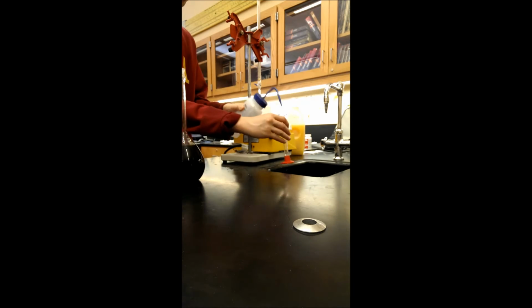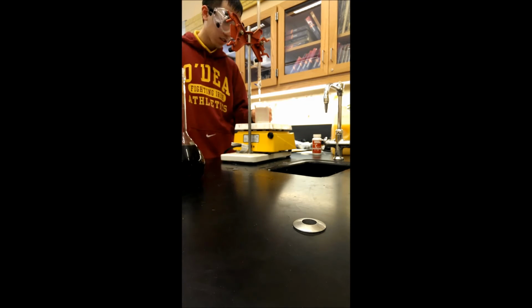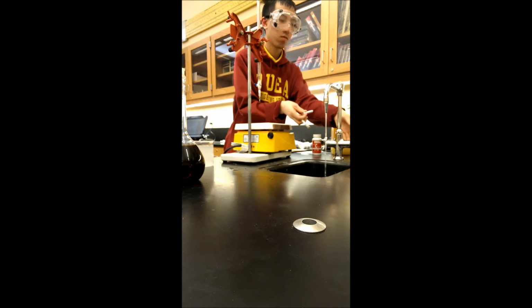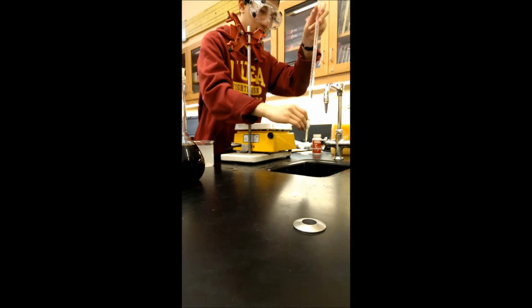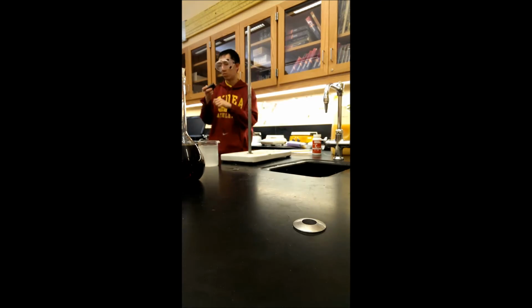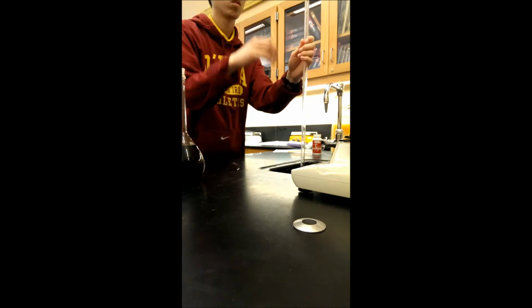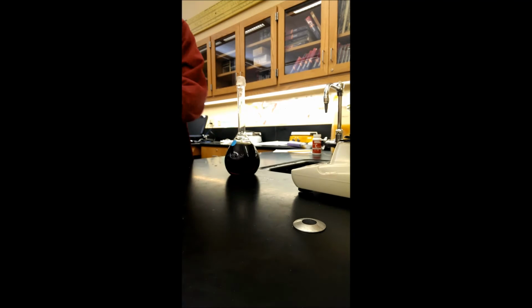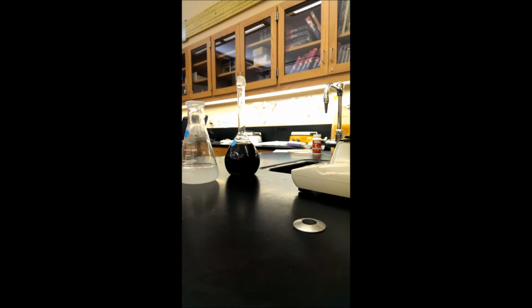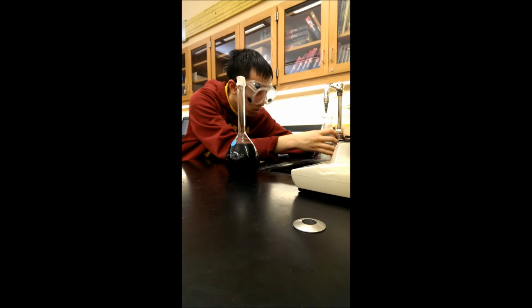I ended up doing that first titration twice, because the first time was just a test to see the endpoint color, and then the second one was the real actual reaction titration. And so the second solution I did, if you didn't notice, was the vitamin C tablet solution, and that didn't turn out well because it didn't dissolve in water, so that was just a dud. And since I ran out of distilled water, I couldn't do any more titration, so that's all the data I have.